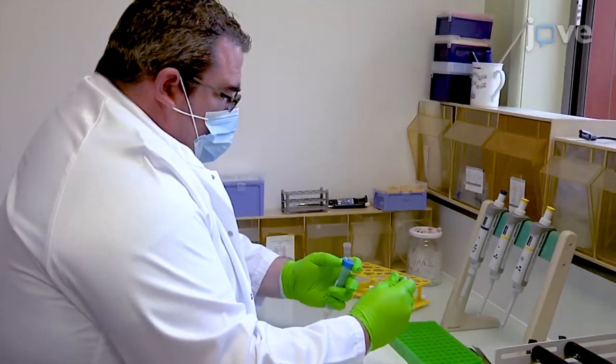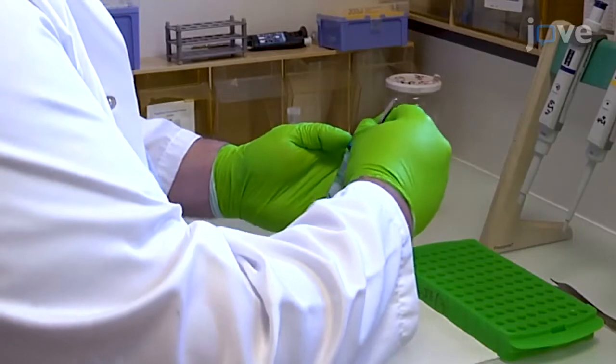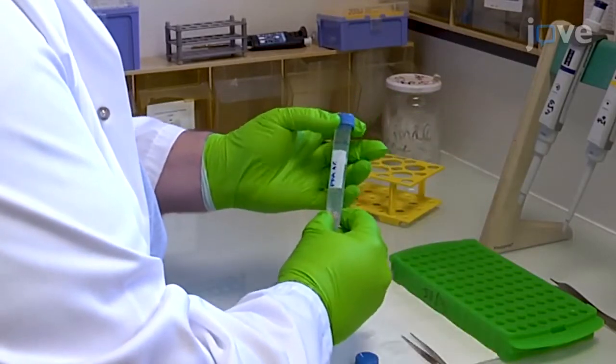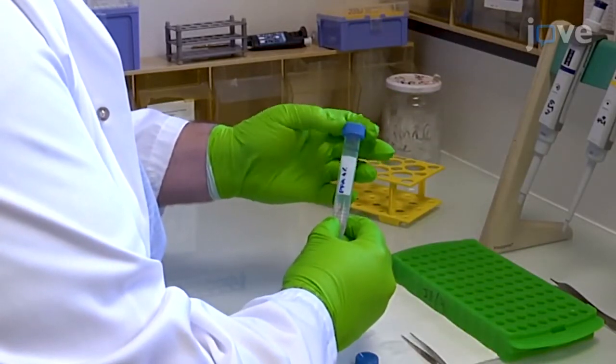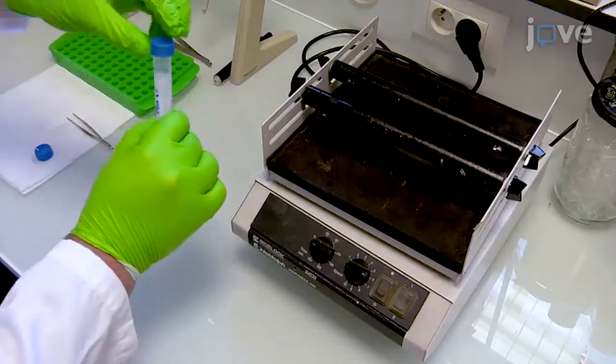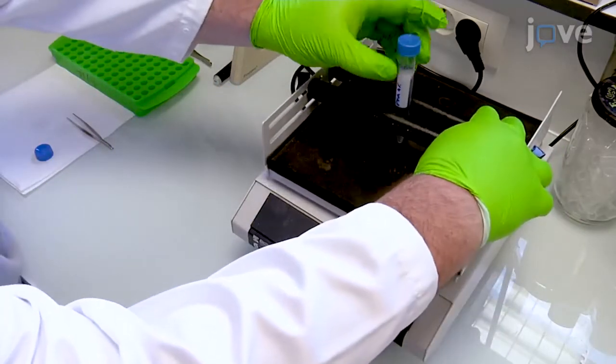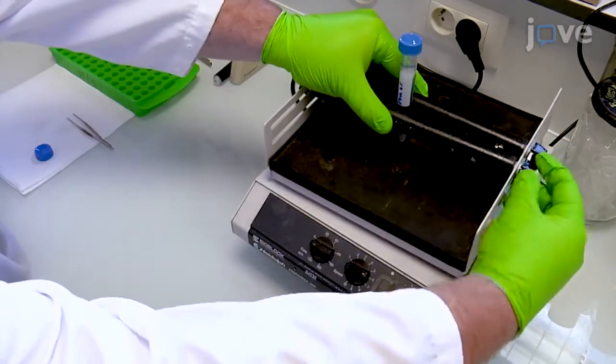Begin by immersing the harvested mouse or human white adipose tissue in at least 10 mL of 4% paraformaldehyde in PBS in a 15 mL plastic tube, preferentially under a chemical hood.